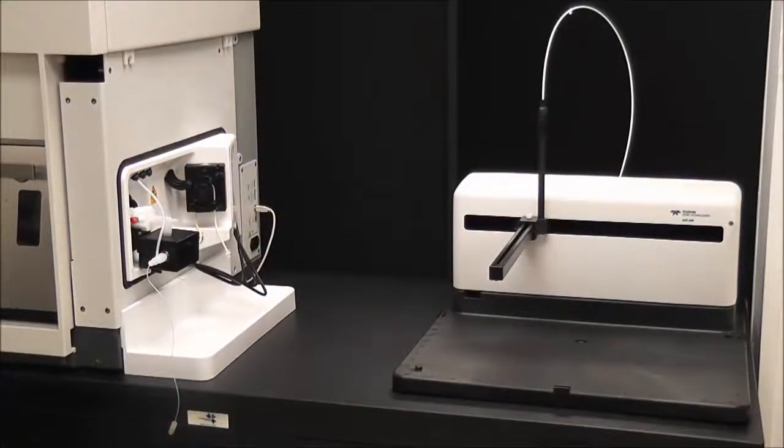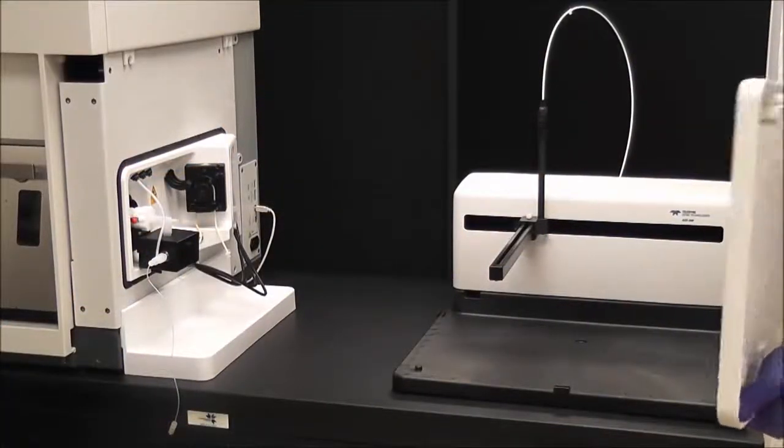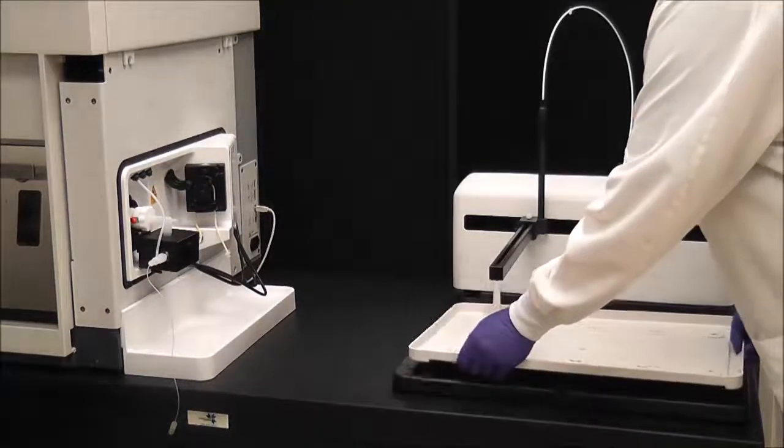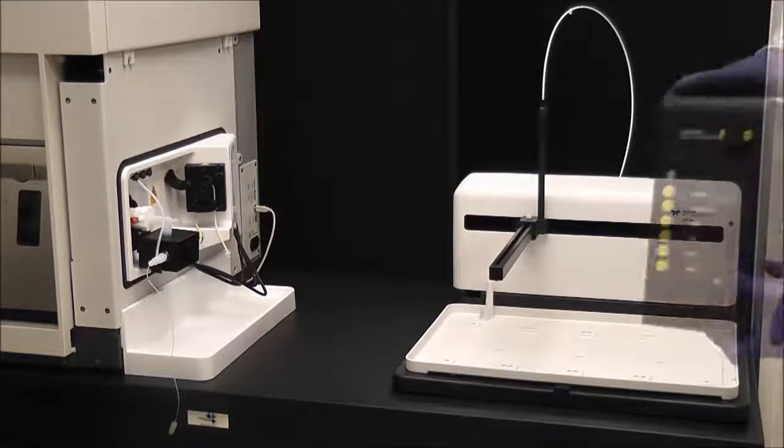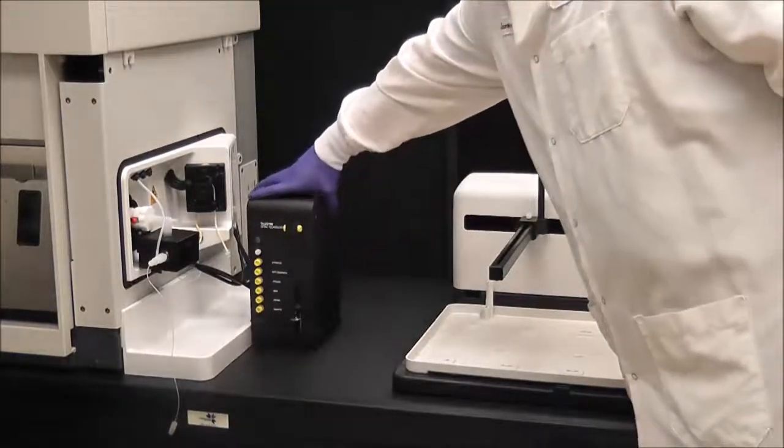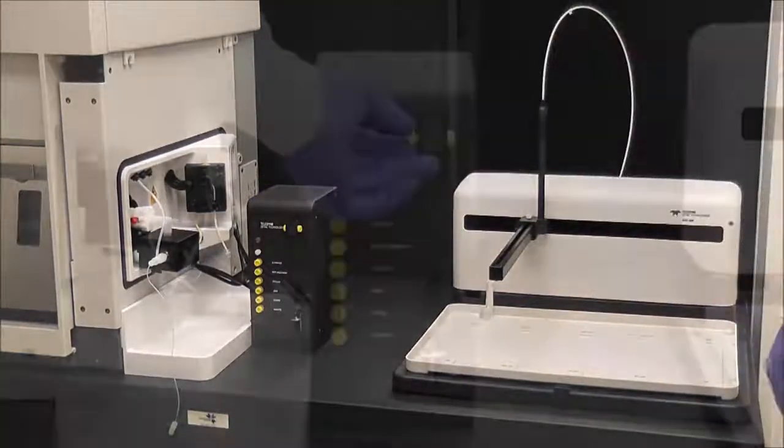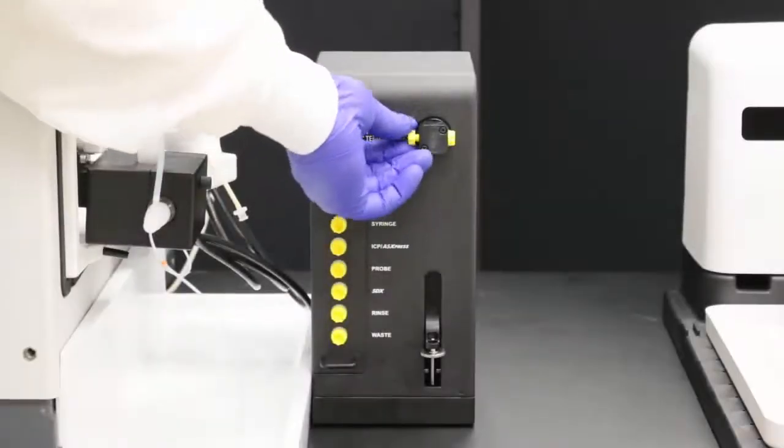Let's begin. Install the SDX spill tray. Place the SDX pump module next to the auto sampler. Remove the protective yellow caps.